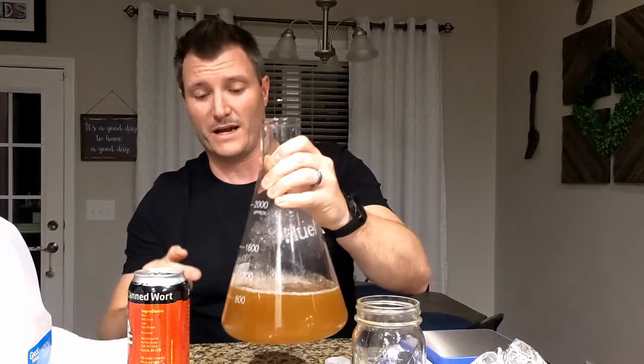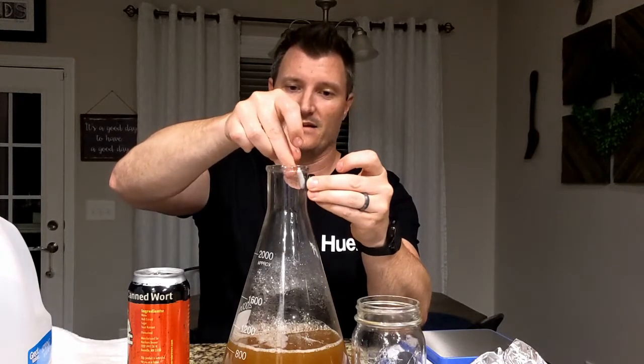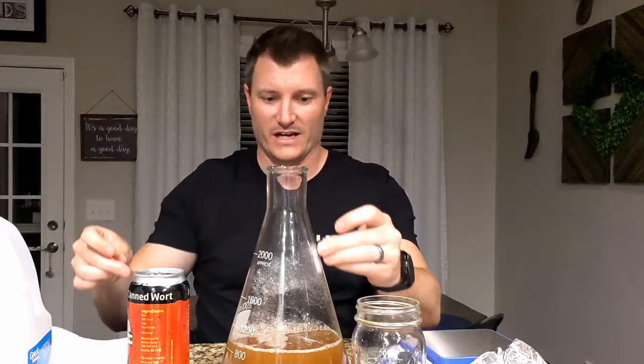Last but not least, we've got to put the stir bar back in, get it swirling, and then cap it again with tin foil. One thing you can do — the same way we removed the stir bar with a magnet so you don't drop it in and break the flask — is either tilt the flask or use a magnet, stick it to the side, bring it out of your sanitizer and carry it all the way down to the bottom. That'll help prevent the metal stir bar from breaking the glass. Then just put it right back on your stir plate and get that thing stirring.